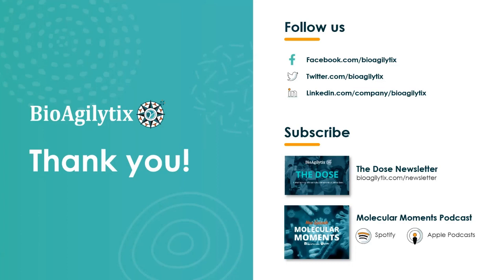And Shishin, I don't know if you have anything to add with that respect. No, I think you covered it well. And yeah, the sample matrix will be different. And also, I think for the validation parameters, for the CMC VCN testing, we usually have the pure drug product sample. So the sensitivity is not a great concern for the CMC assay, but for bioanalysis, for some samples, it may be a concern. It's a focus during the method development.